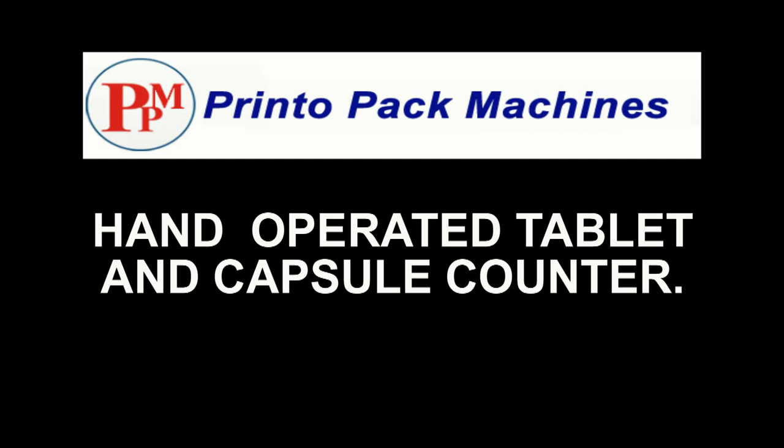Hi friends, welcome to our manual capsule and tablet counters demonstration video.